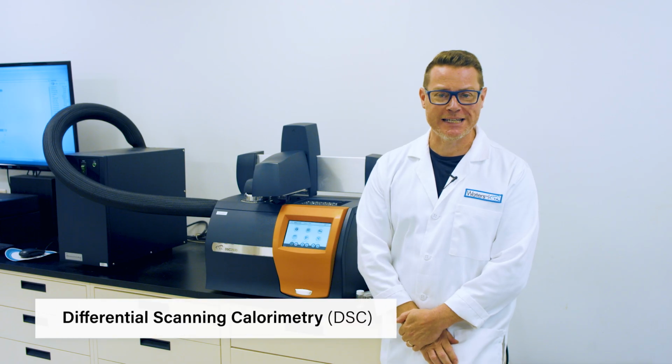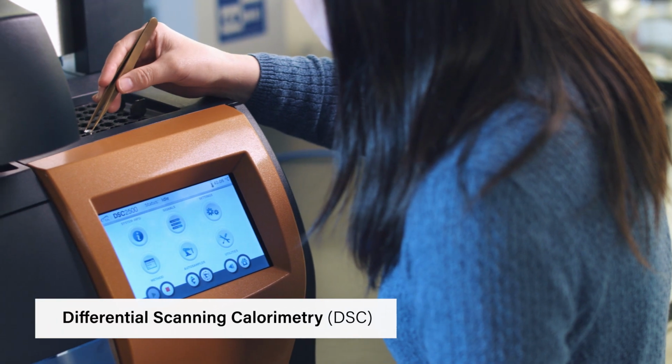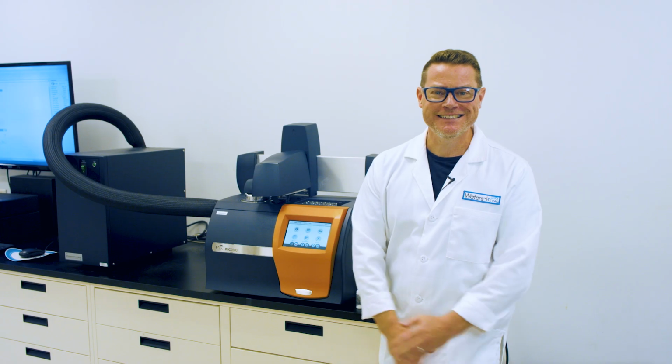In this video, I'm going to talk about differential scanning calorimetry, or DSC, what the technique is, how it works, and what information you can get from the data. Firstly then, what actually is DSC?